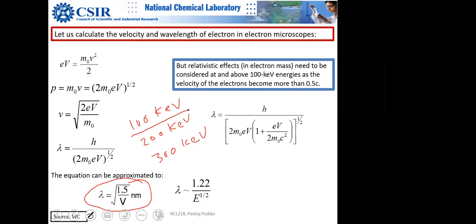Of course, you know, we are talking about high energy electrons here. This energy is very high. Believe me, if the entire energy of the electron beam is transferred to your skin, your skin will just become plasma actually. Okay, believe me. So don't ever do that. Okay.